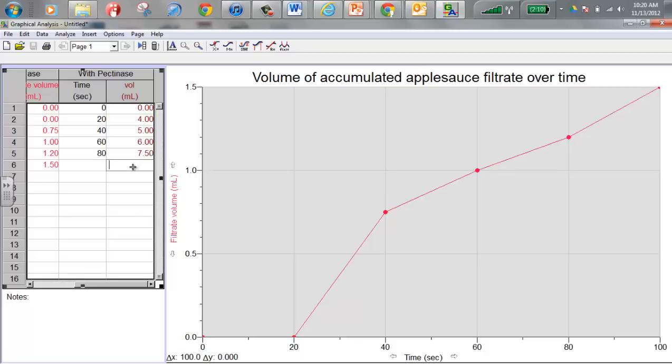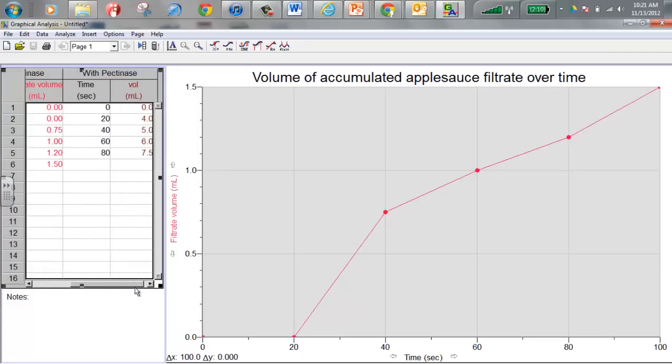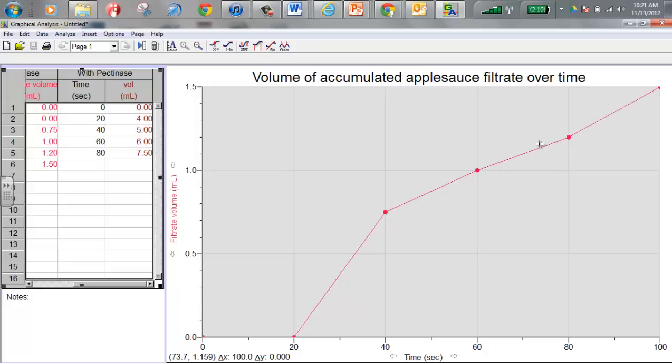I can keep going. Here's a point I would make - do you see how the numbers are 0, 20, 40, 60, 80, 100, 0, 20, 40, 60, 80? Your numbers don't have to be exactly the same. They can be, but they don't have to be the same. But you saw me put in numbers - did you see the line go? Is there a second line? No. So what you have to do is tell the computer to not only graph this first data set, you have to tell it to graph the second data set as well.